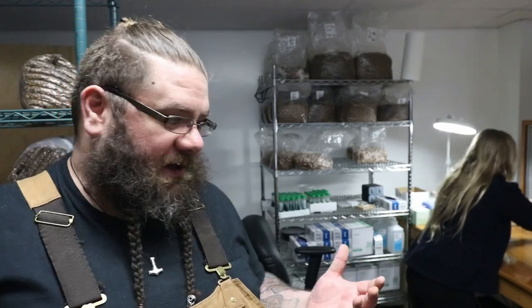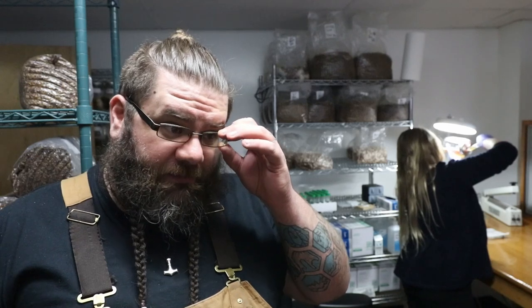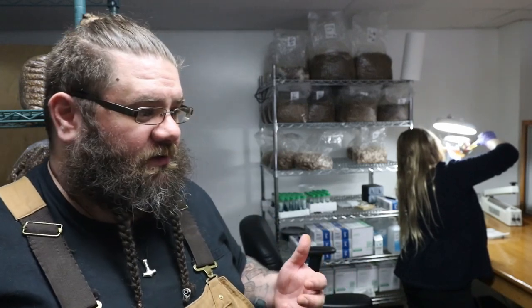But I thought for this week, guys, we would just go over the difference between pressure canners, sterilizers, and autoclaves. These are almost entirely steam sterilization devices that we're going to be talking about. We're not going to be discussing anything as far as dry heat, so nothing about kilning or kiln autoclaves or the hot air autoclaves, which I don't even know if those are technically autoclaves or not. I would have to check that out.